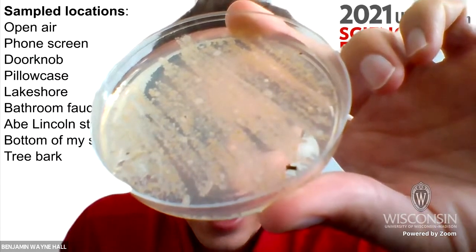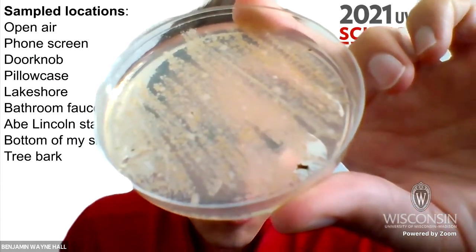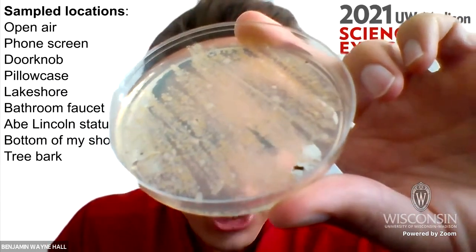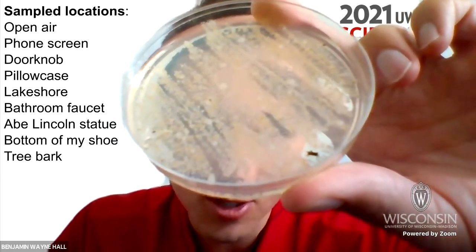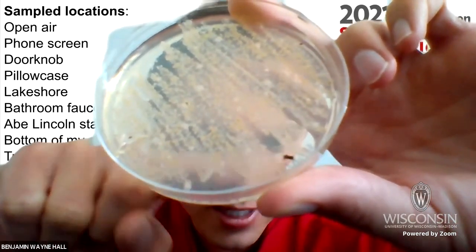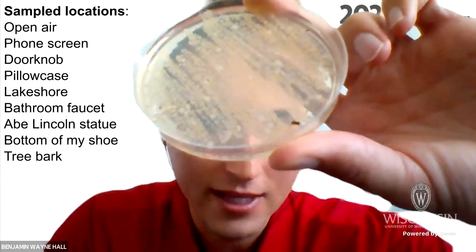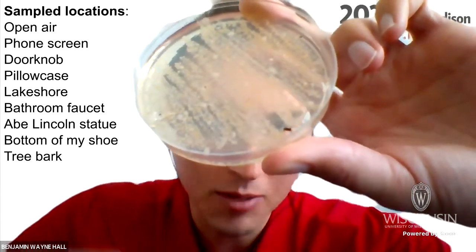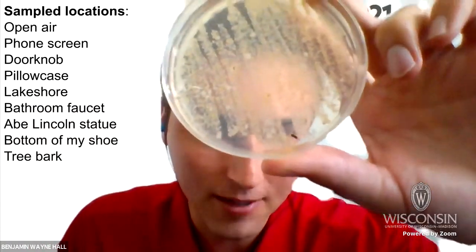So we can see at least 2 different colors on here. Probably more if we look carefully, but there's some yellows, some oranges, some whites, and maybe some cream colored bacteria. I will point out this big brown speck is just a piece of twig from the ground. So that was there when I made the sample. That's not bacteria growing, but the rest of these streaks, this is all bacteria.